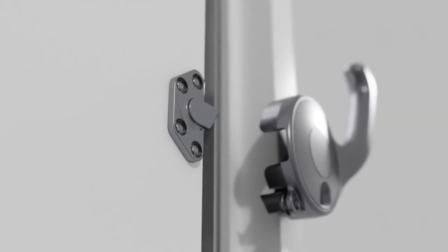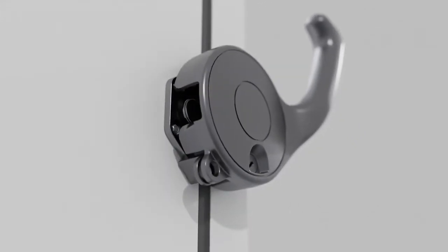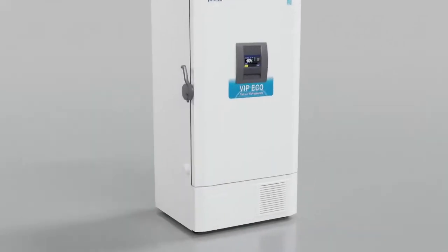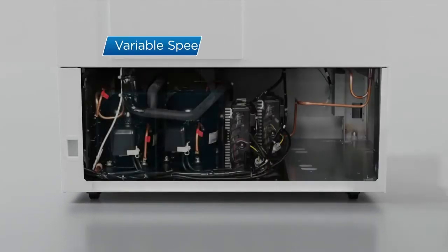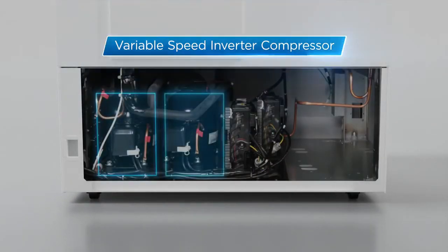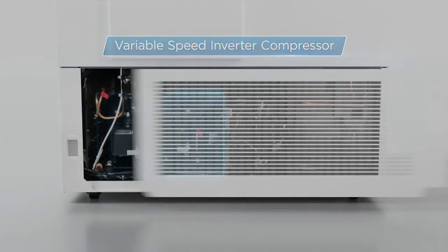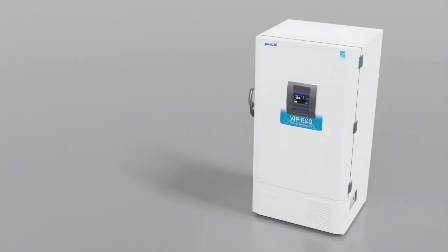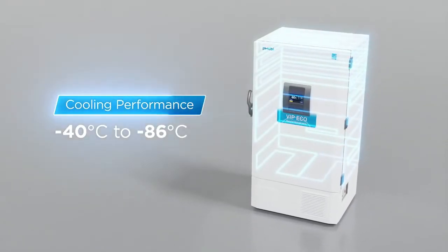And the design ingenuity doesn't end there. PHCBI brand products' powerful inverter technology allows each compressor to speed up and slow down gradually, circulating a consistent flow of refrigerant through a tight network of tubes throughout the walls of the freezer.